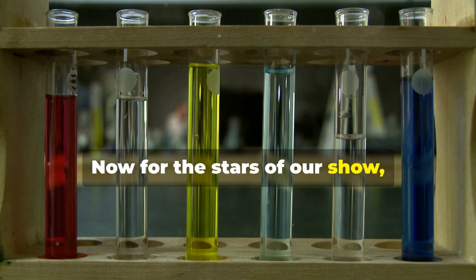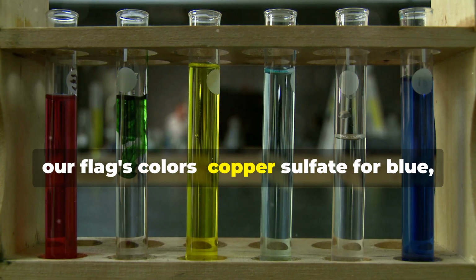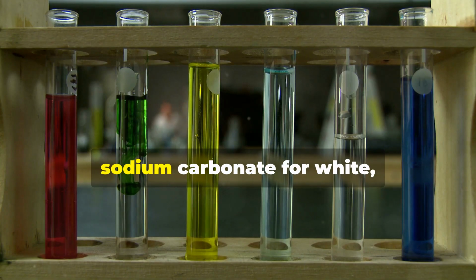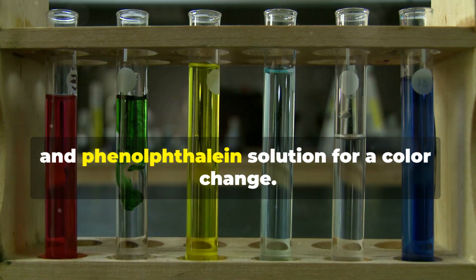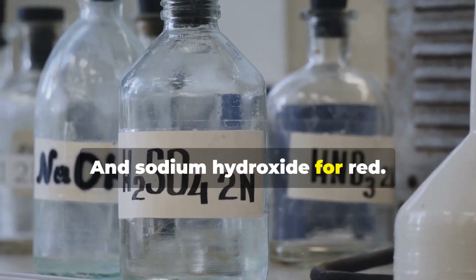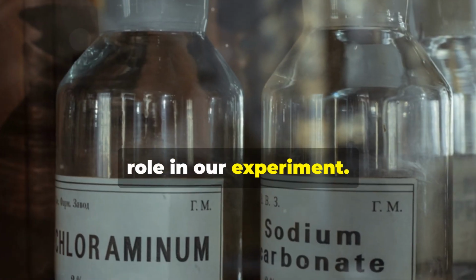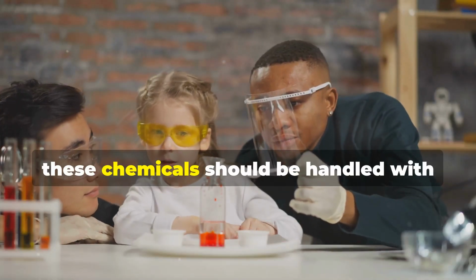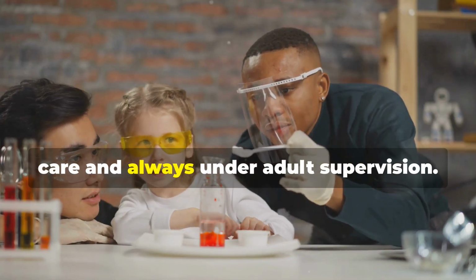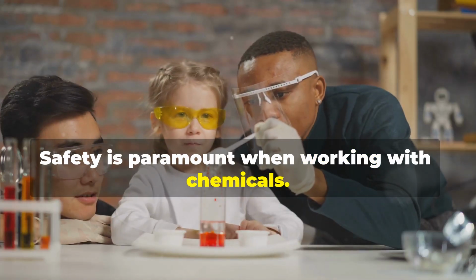Now for the stars of our show, the chemicals that will help us create our flag's colors. Copper sulfate for blue, sodium carbonate for white, and phenolphthalein solution for a color change, and sodium hydroxide for red. Each of these chemicals plays a unique role in our experiment. Remember, these chemicals should be handled with care and always under adult supervision. Safety is paramount when working with chemicals.